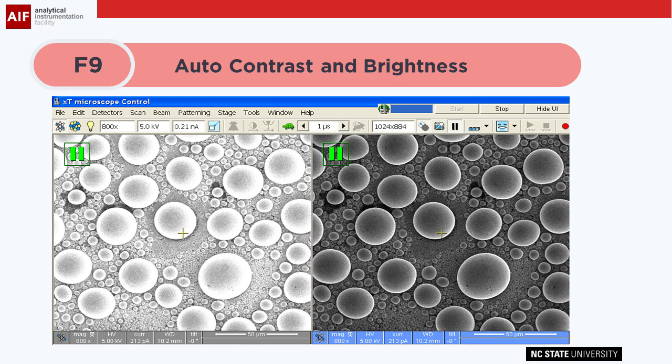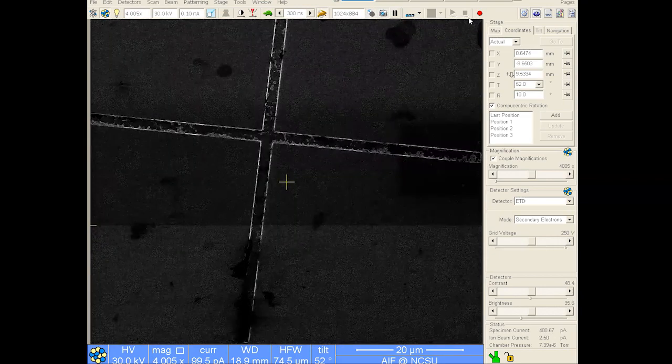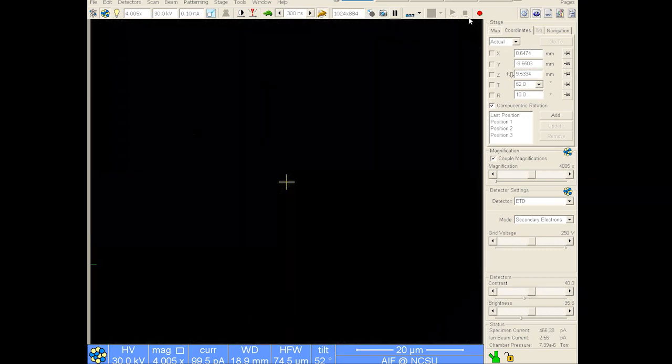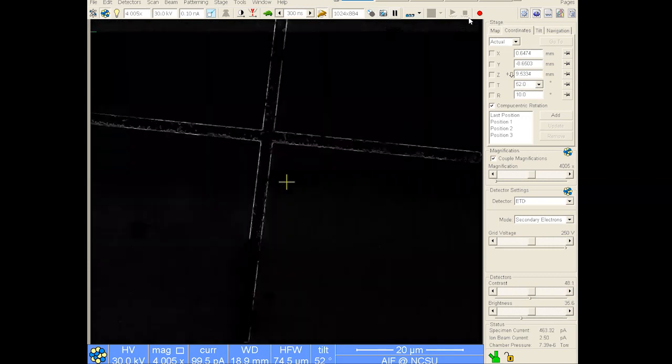I'm not a big fan of automated features, but I've started to realize that some are very useful. Now, I know for intermediate level users, a lot of times getting the right contrast and brightness is a little bit daunting. A lot of times you'll get something really dark, as you're changing currents, or something overly bright, and you don't know whether to adjust your contrast or your brightness.